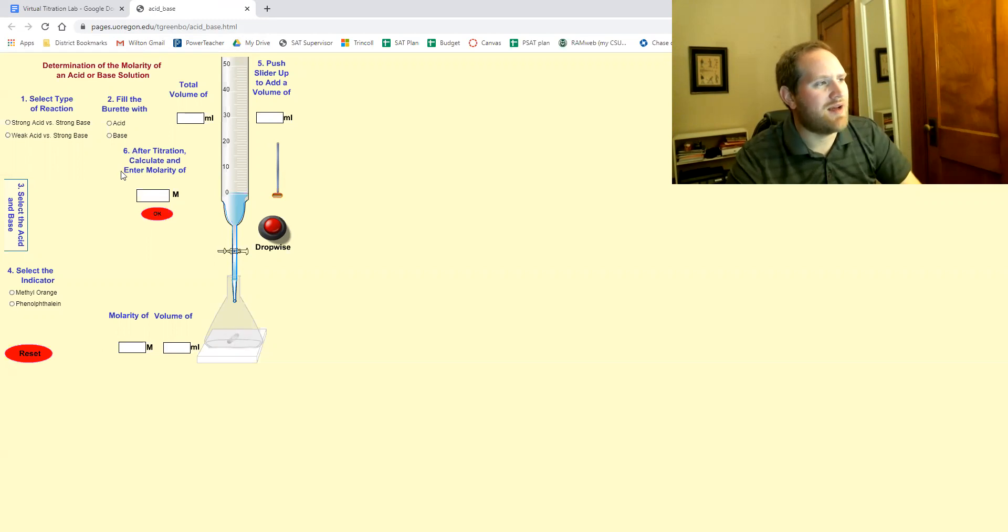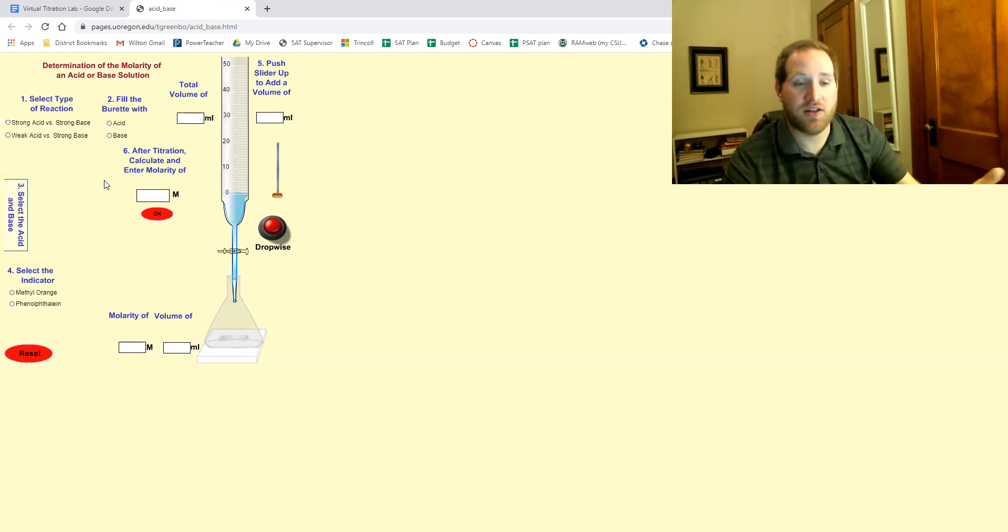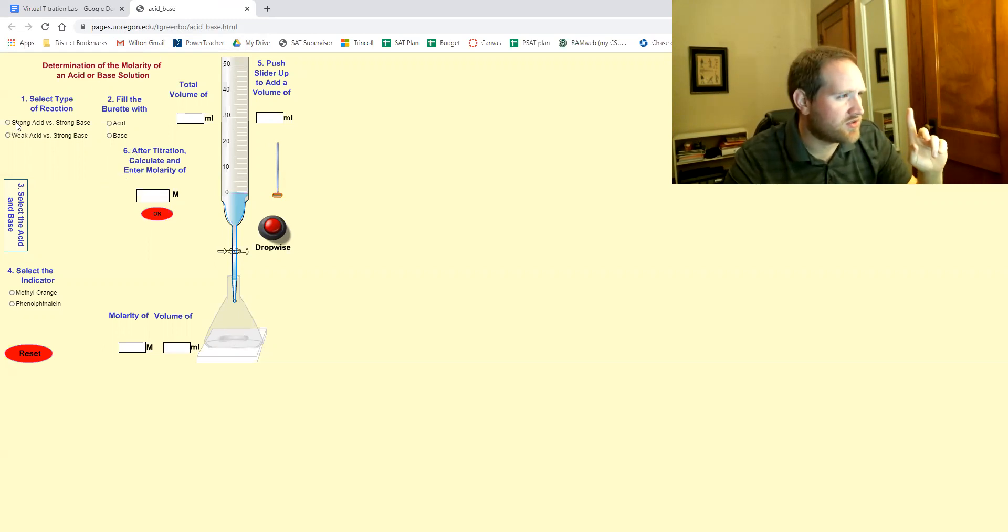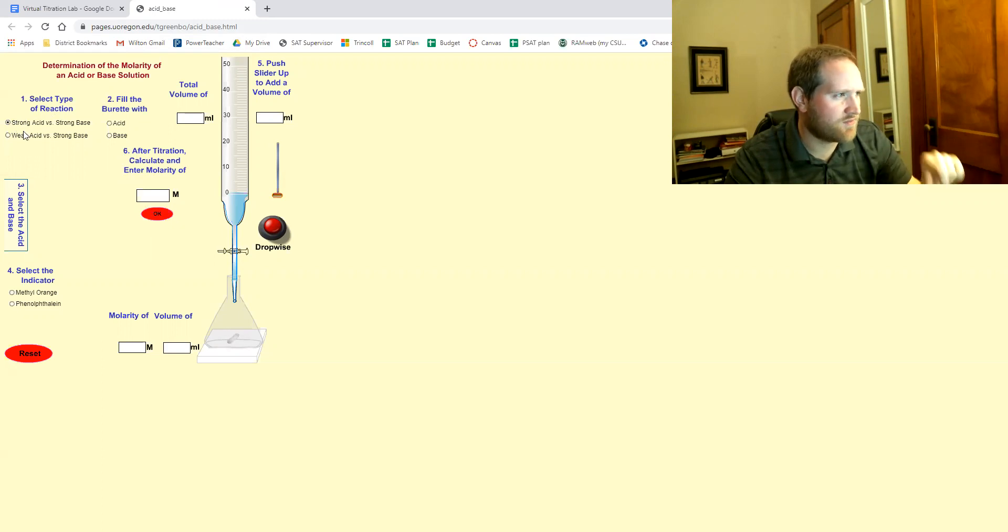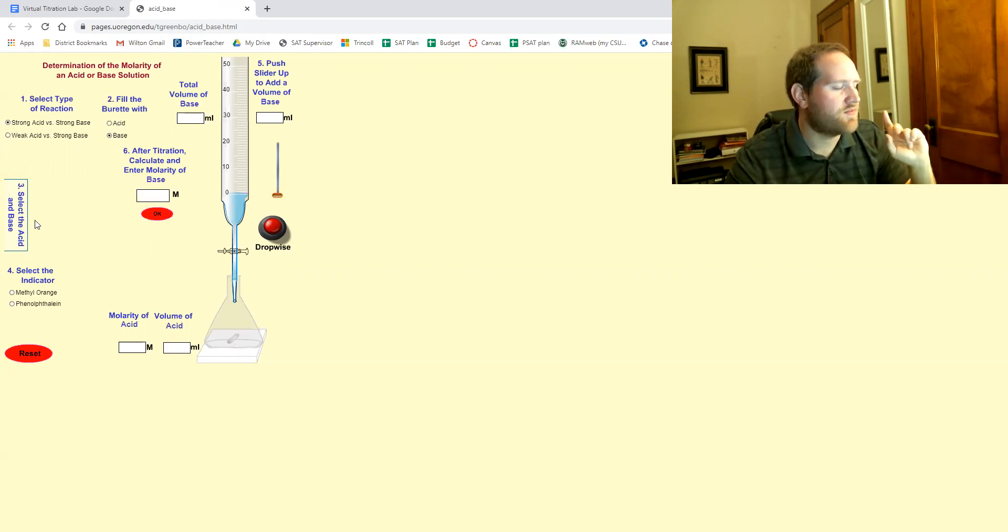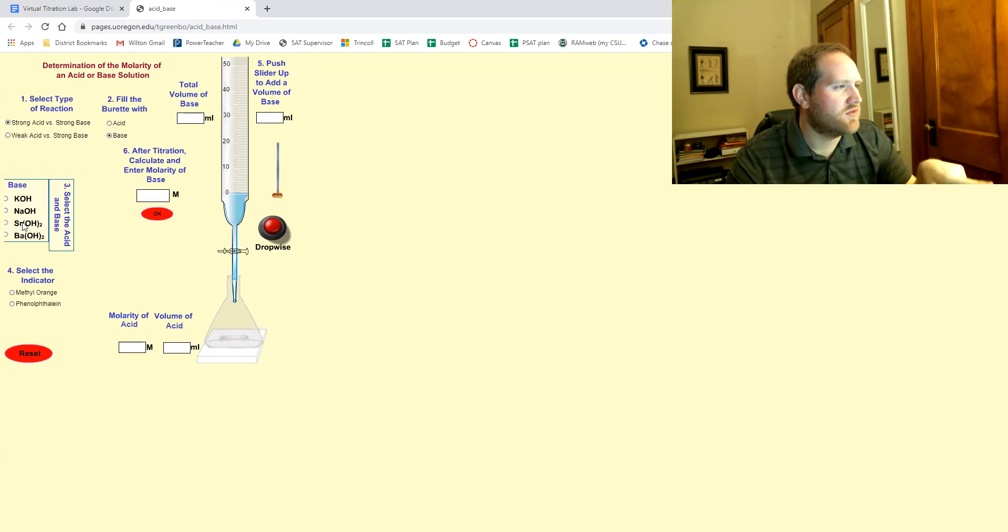Okay, so here's the lab. So you're gonna follow the steps in the procedure, but basically we're gonna be doing strong acid versus strong base. We're gonna be filling the burette with base. Number three, click out here.